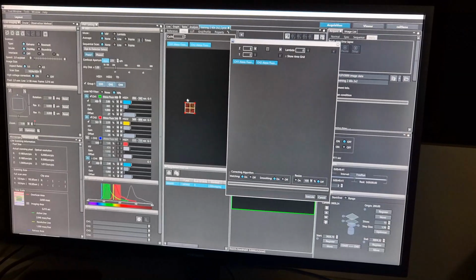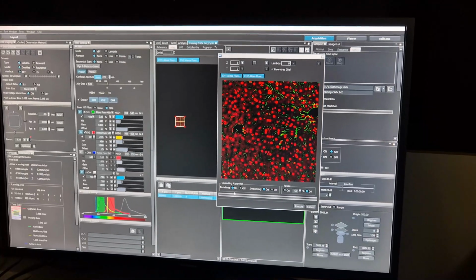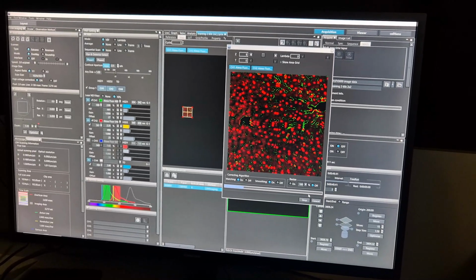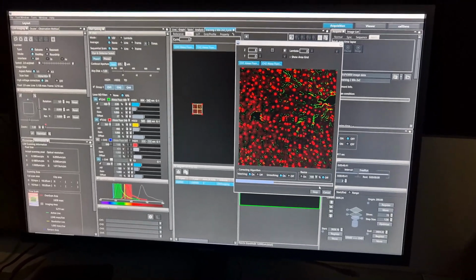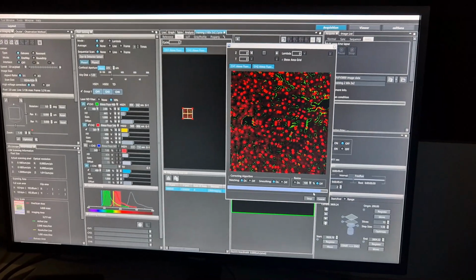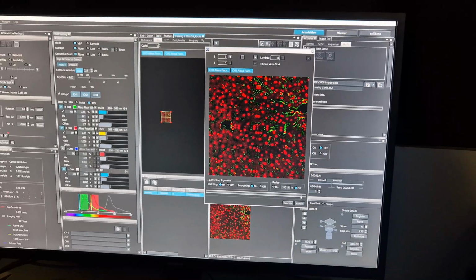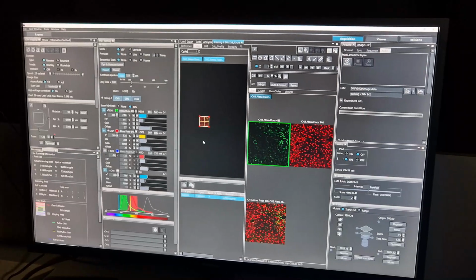So currently these are just neighbouring each other. They're not actually stitched into one final image. It shows you a preview. Make sure smoothing and matching algorithms are on. Press execute. Sometimes it can take a long time, because if you have a lot of things that go together, sometimes you have to walk away and let them come back if it's big enough. Okay, so that's done. Now, it's not going to automatically close this window. You're going to close it or press cancel. And close. And now we've got the image.